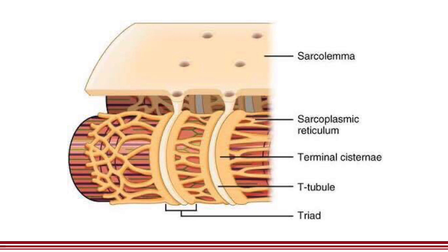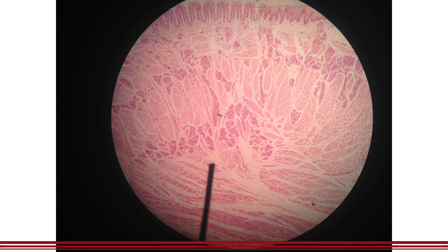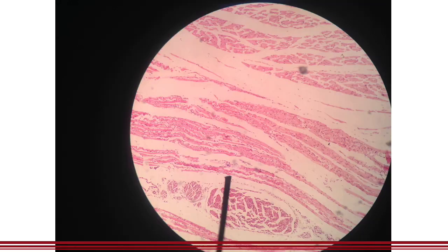Here are photos of skeletal muscles. Here you have longitudinally arranged muscle fibers.